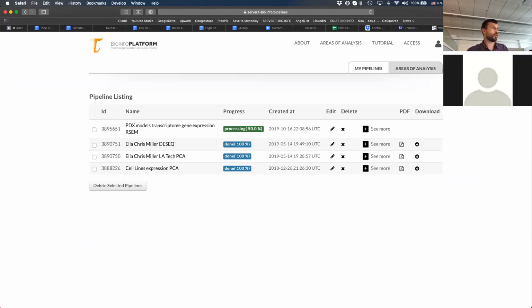Sure. So what we're going to do is prepare you to do this in a meaningful way. Right now, we want to first focus on just RNA-Seq type data, and learn about processing, because processing will give you an idea of what signal you're looking at. Once we establish how to process data, which is always going to start from a FASTQ file, but FASTQ files come in a variety of formats. They could be compressed, for example, SRA. They could be already mapped, that could be BAM or SAM. Or they could be just a FASTA file without the quality.